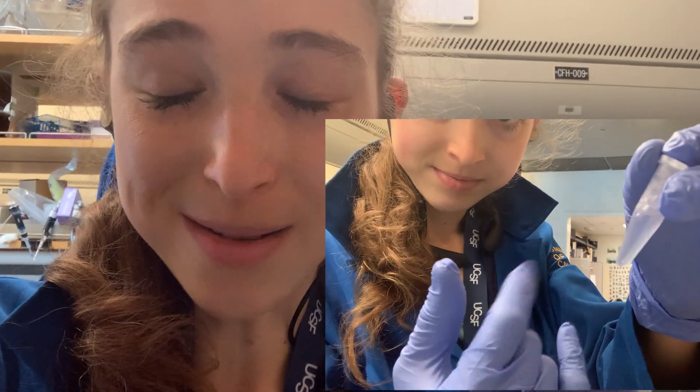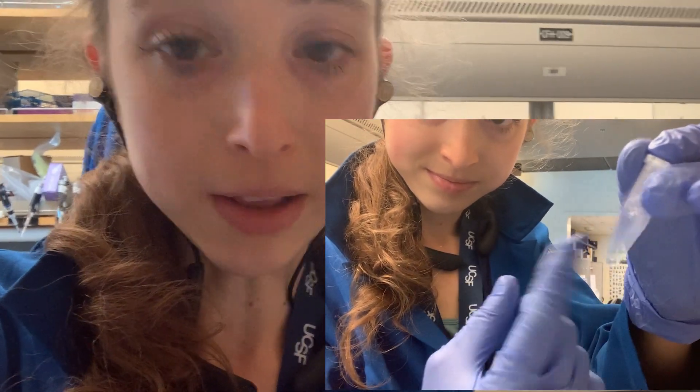My go-to mixer is my finger — I'm a big fan of the finger flick. And that was your fun lab tip for the day.